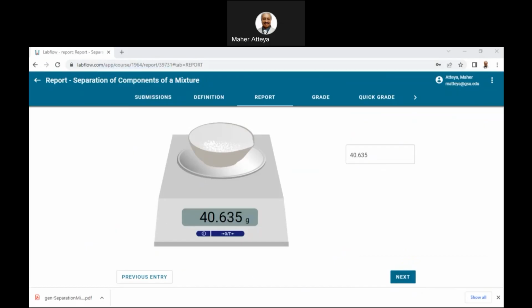And I'm pasting this one here. So this is 40, and then click next. So we are clicking next and copy the arrow here, copy and paste. Take it from here.